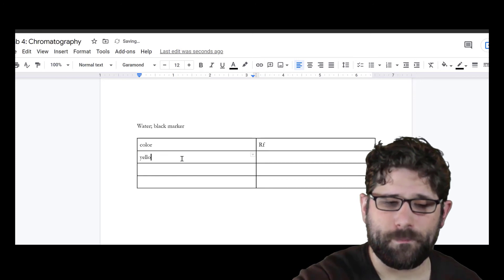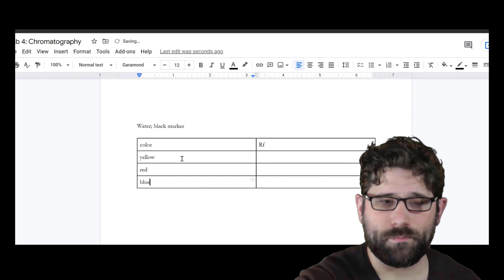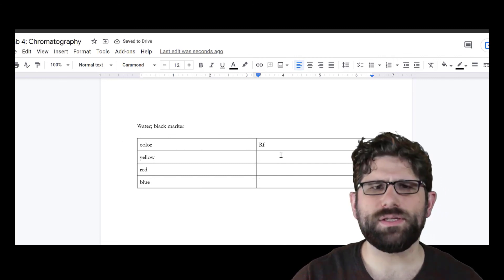Then I've got my color and I've got my RF value. So I've got my yellow, got my red and I've got my blue. Then I just put those values in.